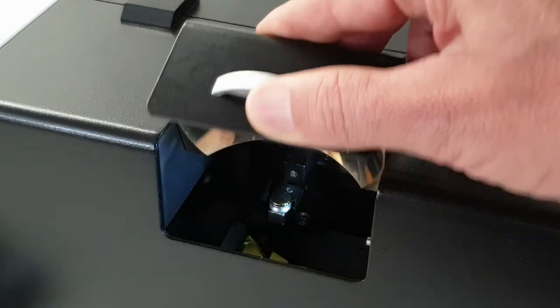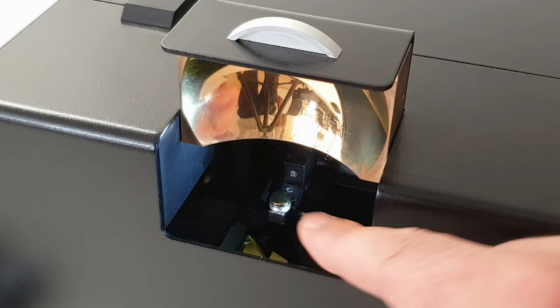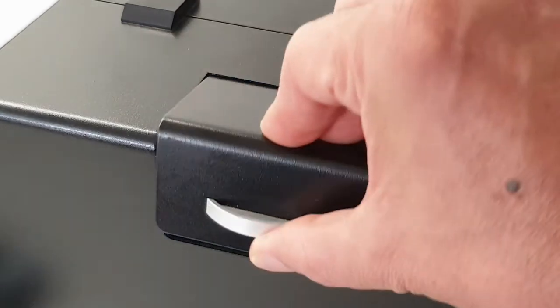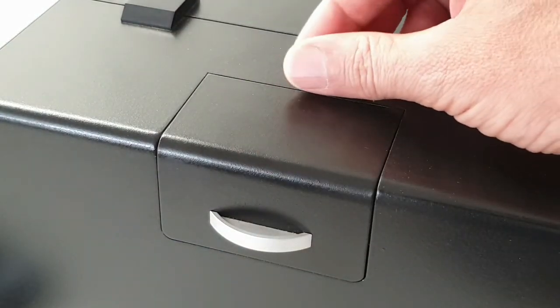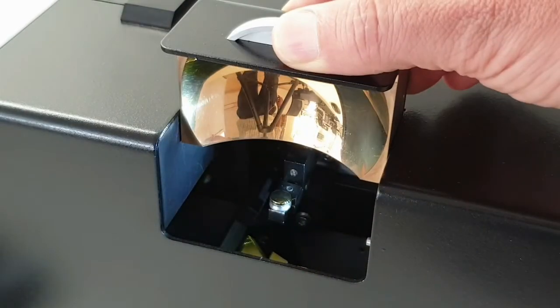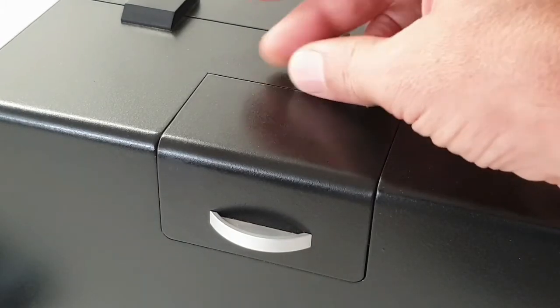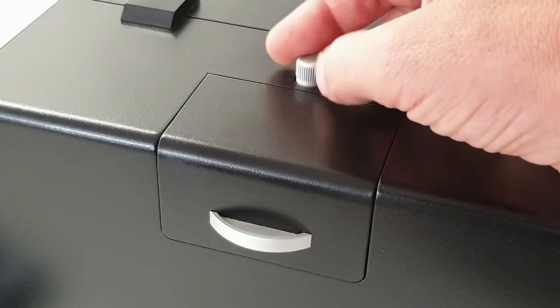Before proceeding with the scan, it's necessary to check if the sample stage is at the correct position. The unit is provided with a micrometric adjustment of the sample stage height to allow different techniques to be used. The height can be modified by turning the knob just behind the sample chamber lid.